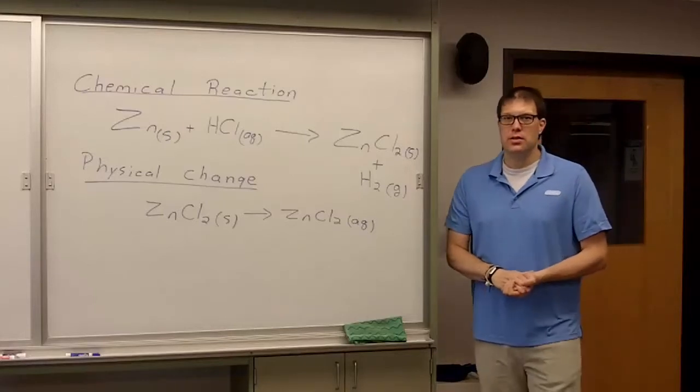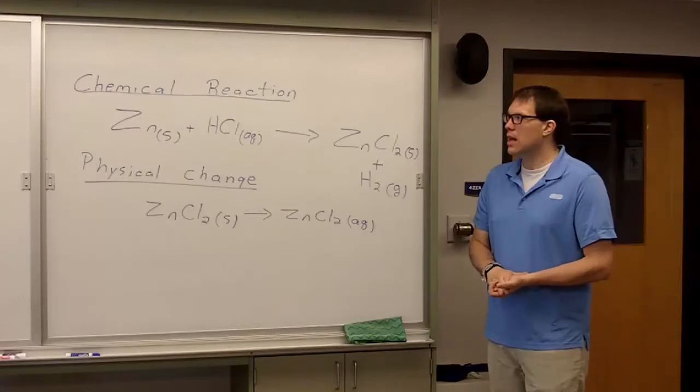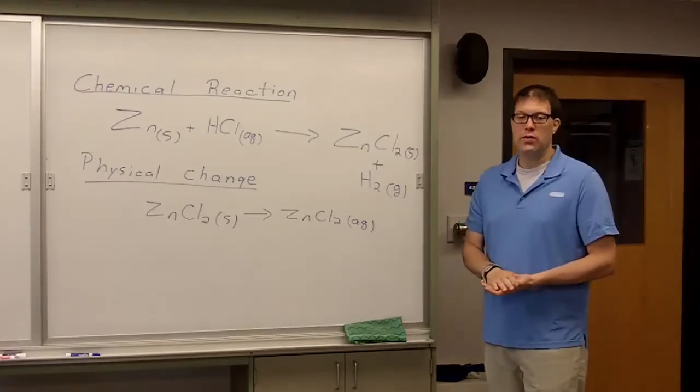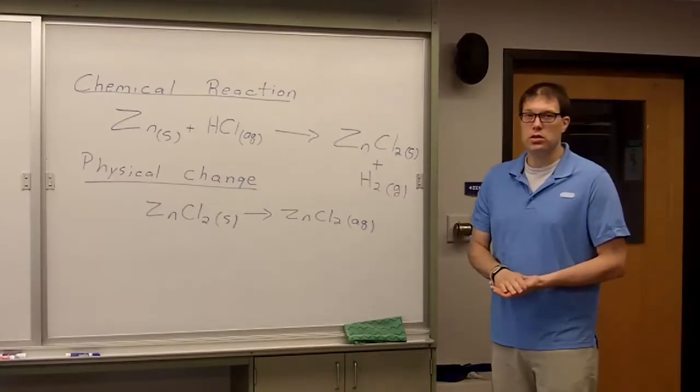My name is Dr. Steve. I am a professor here at NKU, Northern Kentucky University. And today what we will be showing you is a demonstration that has to do with zinc and the formation of zinc chloride. So what actually occurs in this demonstration is two steps.